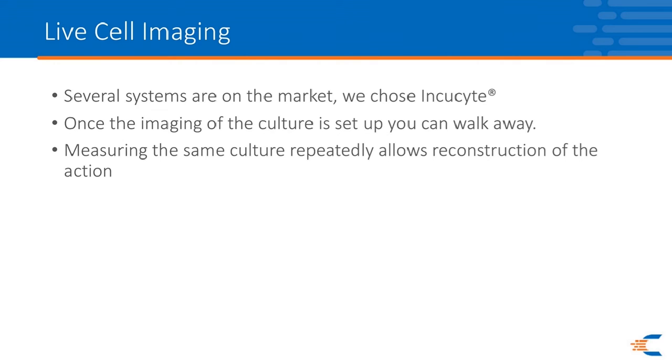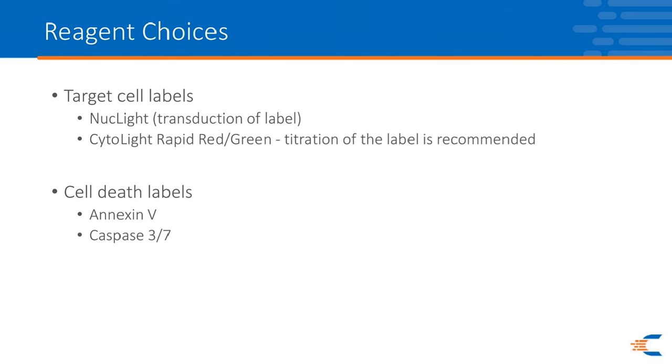And measuring the same culture repeatedly over time can allow you to reconstruct what that action is between the time you put the plate in the incubator and the next day when you come in. There's many things that can happen, as we all know, during that overnight incubation time. And it is very satisfying to be able to see what goes on in that black box during that time. Not to mention the fact that, at least in our laboratory, we're really visual people, so having the images is great.